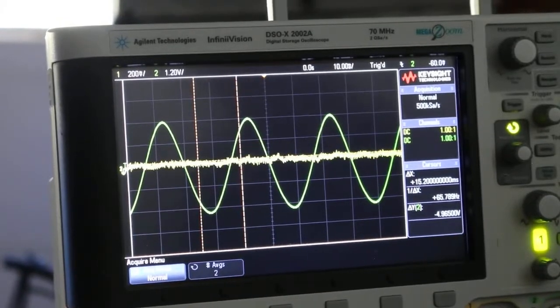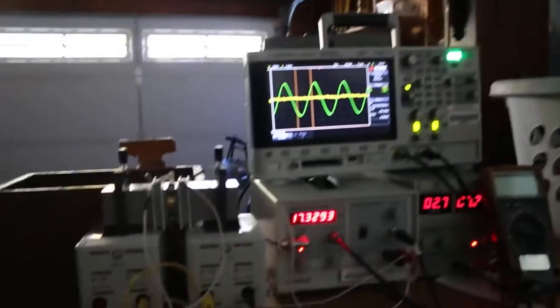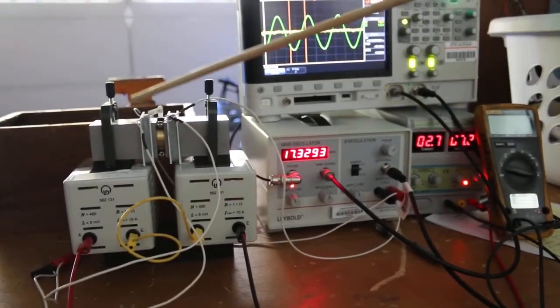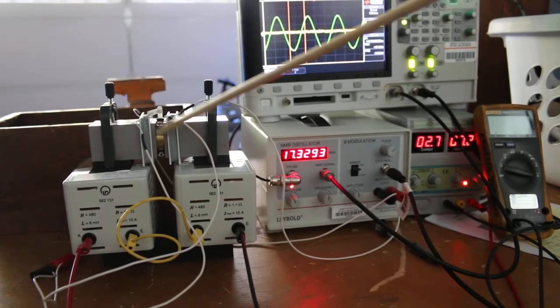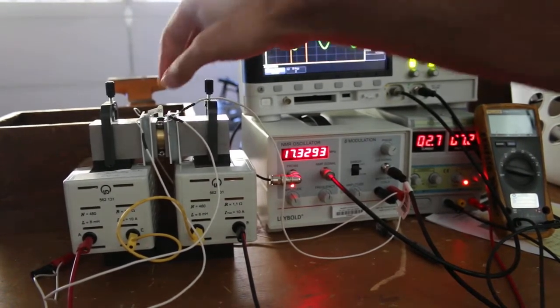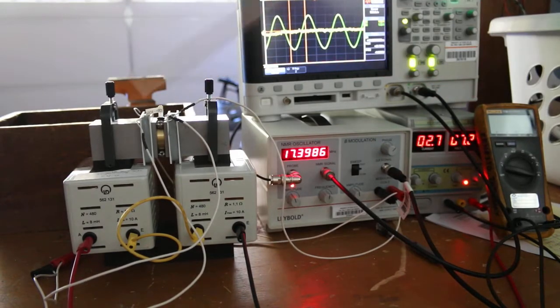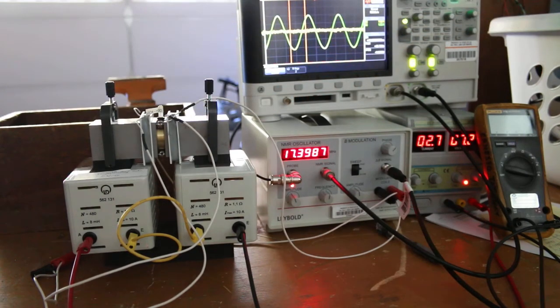So continuing our tour of this continuous wave NMR, we took a global look at all the equipment in the last video. In particular, we looked at the electromagnet, the solenoidal coils that allow us to modulate the static magnetic field, and this little brass sandwich that contains a sample that we drop in, which is a coil where the RF is delivered. So there's a lot going on here.